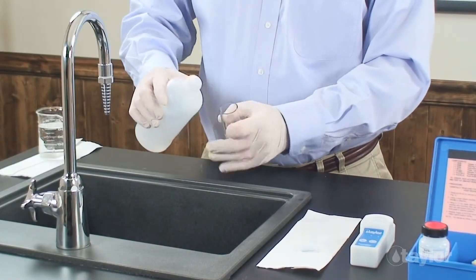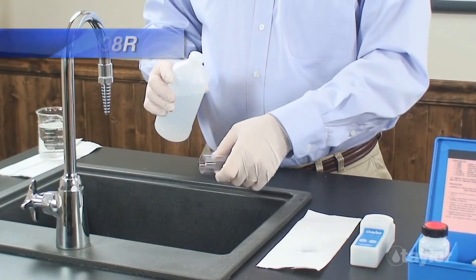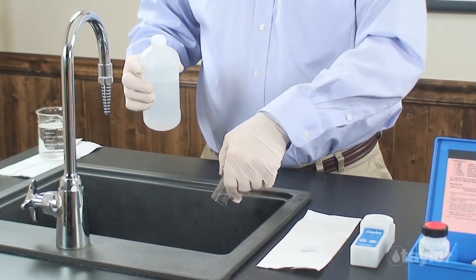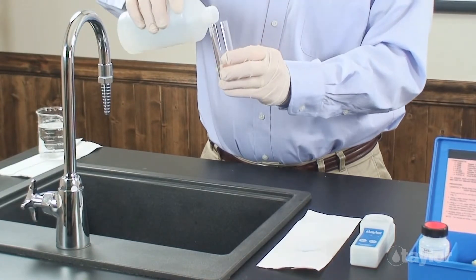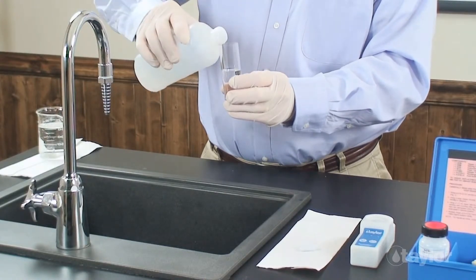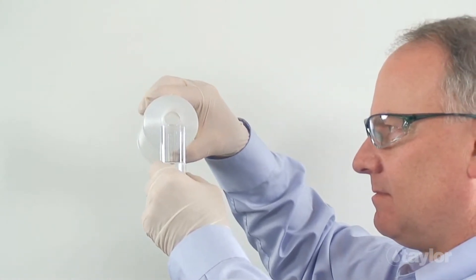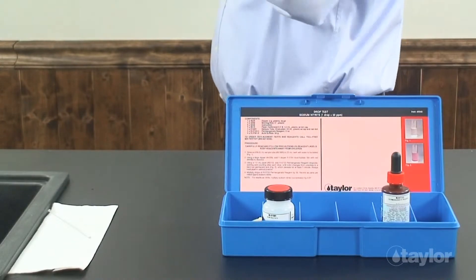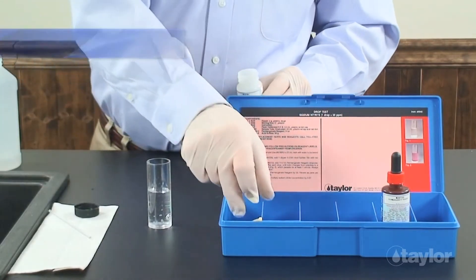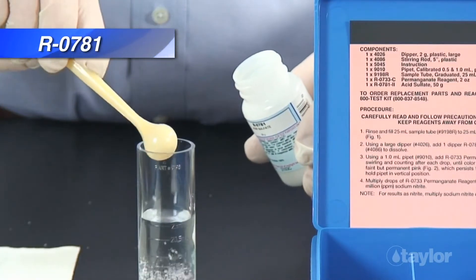Now we're ready to begin. First, rinse and fill the 25 milliliter sample tube to the 25 milliliter mark with the water to be tested. Using the large dipper spoon, add one dipper of acid sulfate and stir with the rod until completely dissolved.